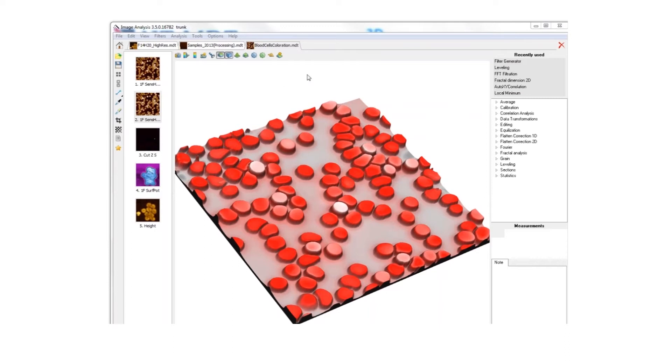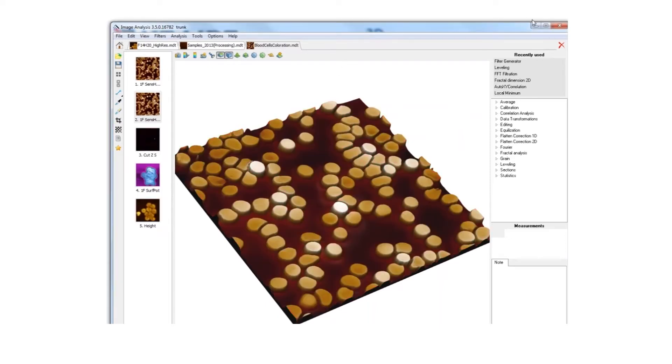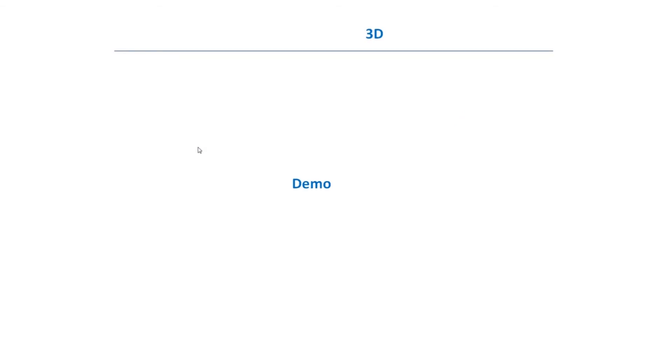Now I see that the image looks pretty nice. This is how 3D imaging can be processed. Some might say that this is just coloration and doesn't deal with science.